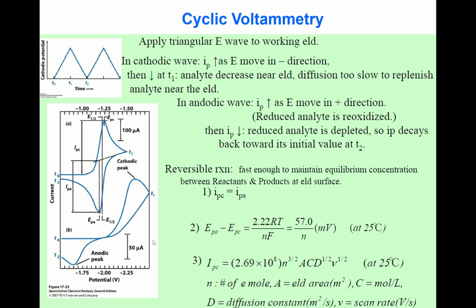And let's look at the cyclic voltammogram B here, right? While the general shape is the same, it gives reduction and oxidation, but here the shape is different, because the cathode peak and anode peak potentials are very widely separated. That means that electron transfer is not fast. Only from this voltammogram we can say that, we don't know which reaction it is, but that reaction's electron transfer rate is quite slow.